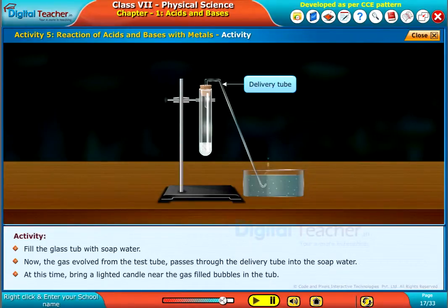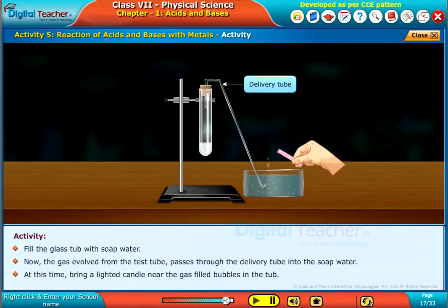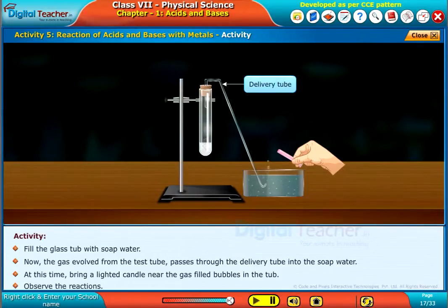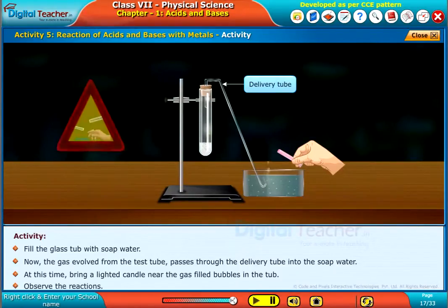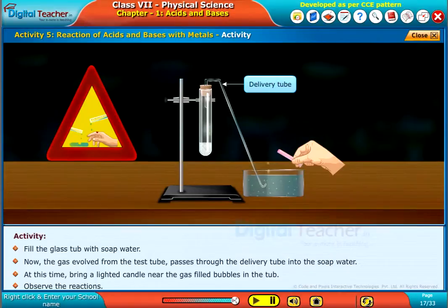At this time, bring a lighted candle near the gas-filled bubbles in the tub. Observe the reactions and make a note. Be careful while handling the acids.